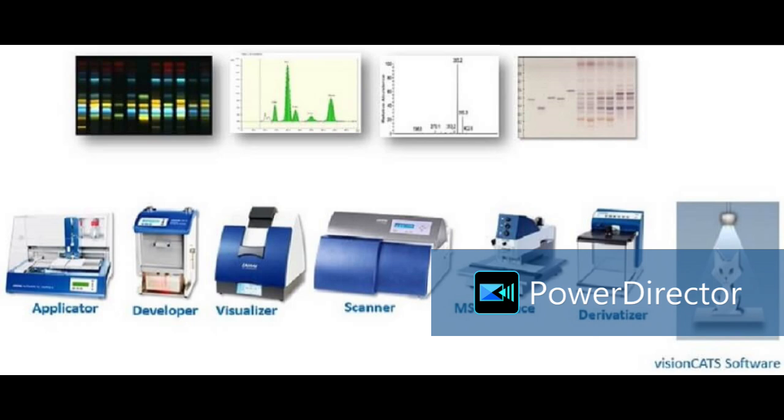And on the other side, Camag. So here you can create your own login. You can download many methods. Section-wise they have provided different application notes, at Camag.com.